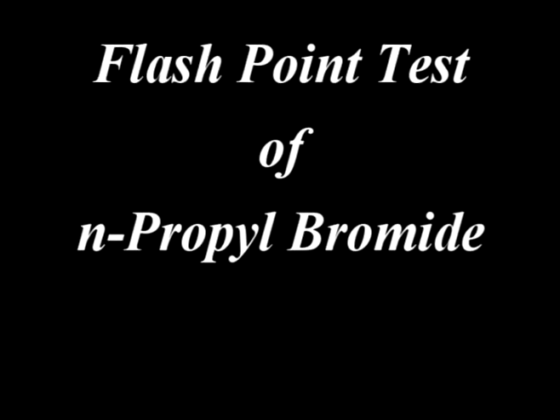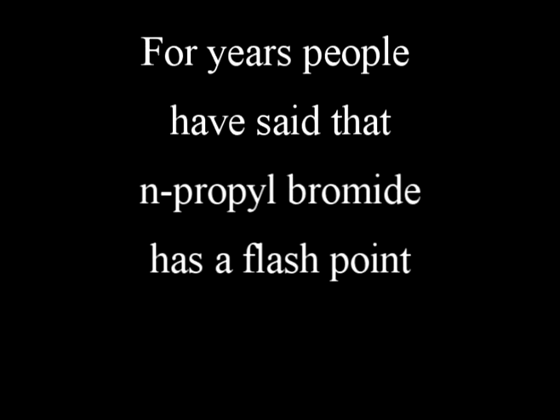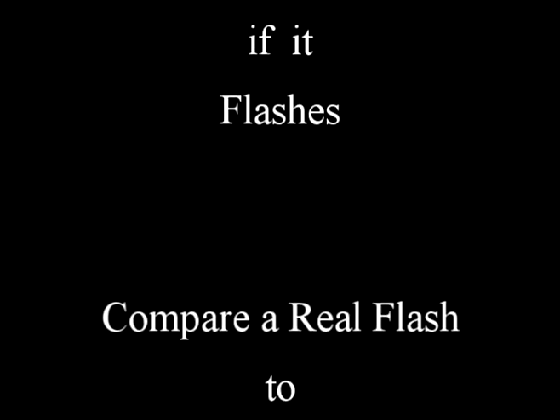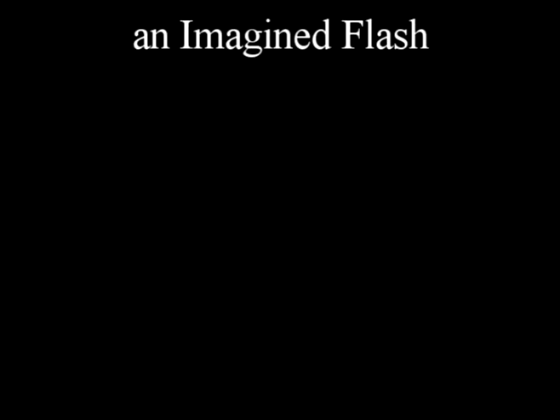In this video, you'll see a flashpoint test of n-Propyl bromide. For years, people have been saying that n-Propyl bromide has a flashpoint. Well, with this video, you will be able to see for yourself if there is a flashpoint for n-Propyl bromide or not. First though, you're going to see a flashpoint test of trans dichloroethylene.